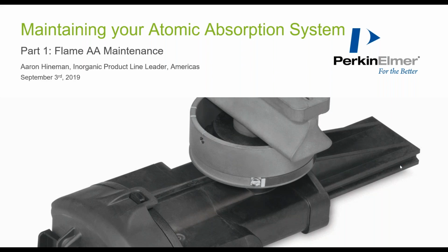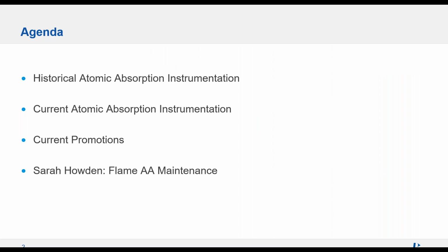Thanks for joining. Glad to kick off this flame AA maintenance, which is part one of our two-part series, as Christine mentioned, regarding maintaining your atomic absorption system. Most of you online, I believe, are users of PerkinElmer AA or are familiar with PerkinElmer AAs over the years. So without further ado, I'm going to move on to the agenda here.